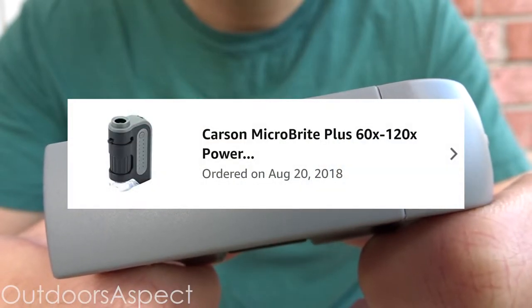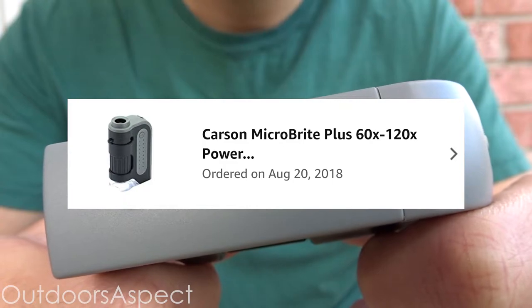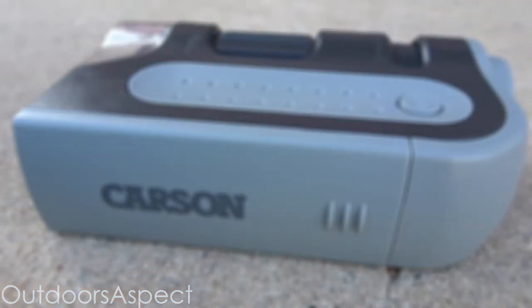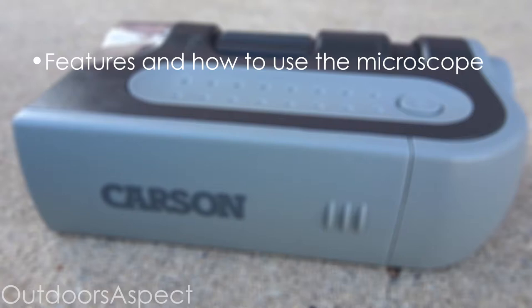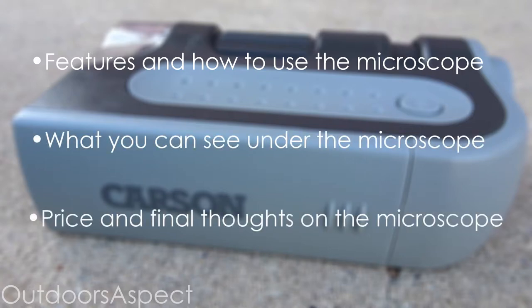Back in 2018 I came across this microscope on Amazon, thought I'd buy it, and it soon became one of my favorite microscopes to use. First I'm going to talk about the features and show y'all how to actually use it, then show what you can see with it, and lastly talk about the price and my final thoughts.